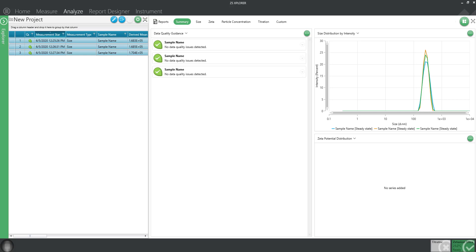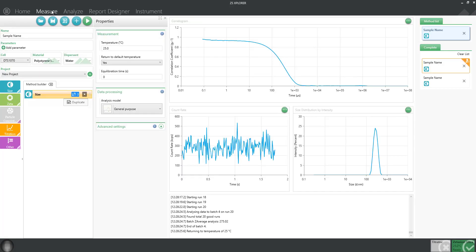Now let's look at some of the more advanced features that you can use for a sizing measurement. If you navigate back to the measurement tab, we can look at other advanced settings for sizing.